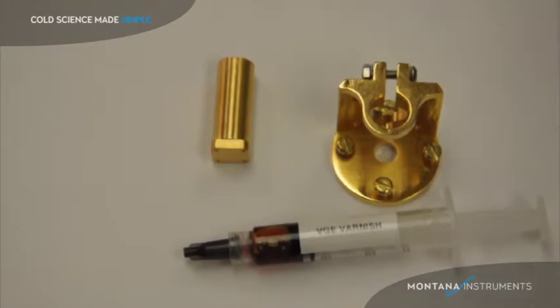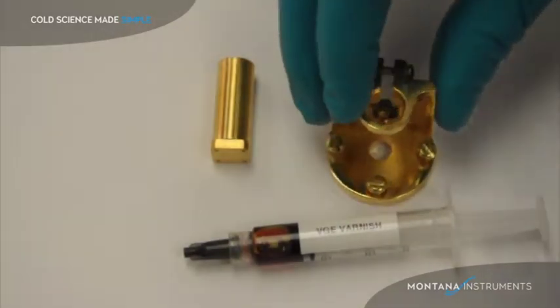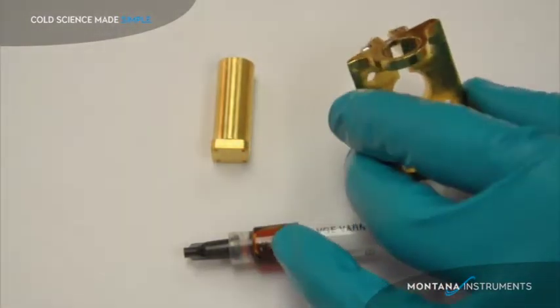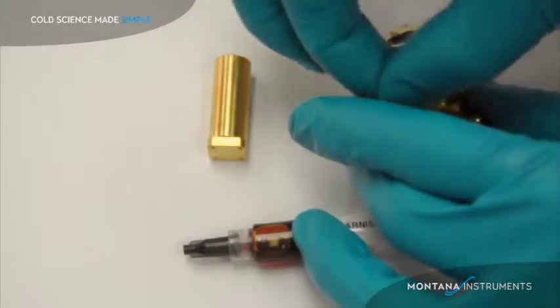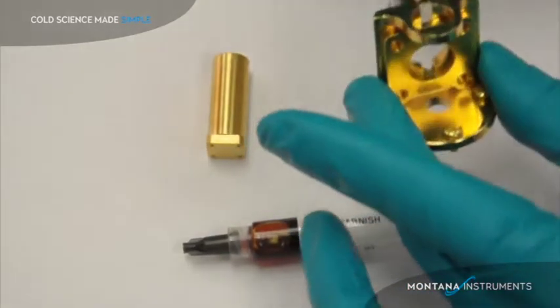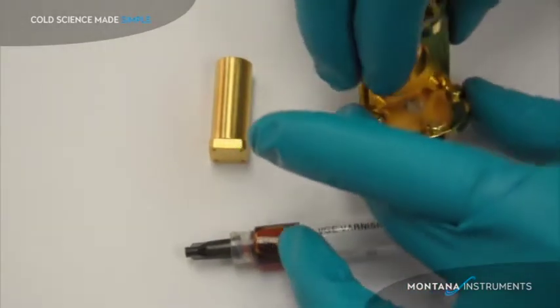Whatever you do, make sure you have a strong thermal connection to the metal. The grip bracket also has holes in the side for mounting a plate, something like this. This would be used for transmission experiments where your beam would be going through the experiment.